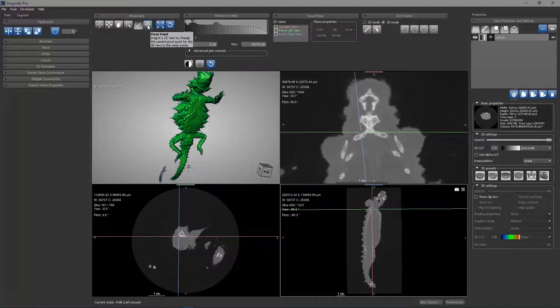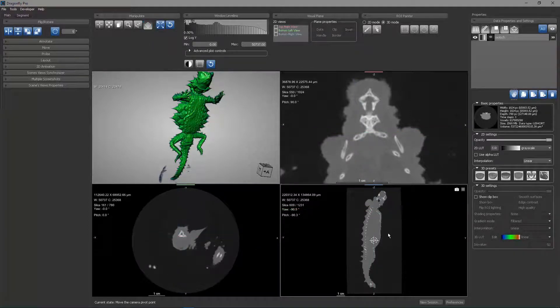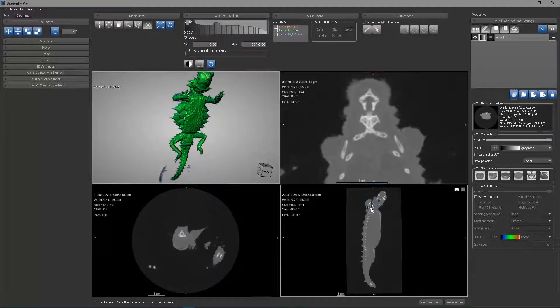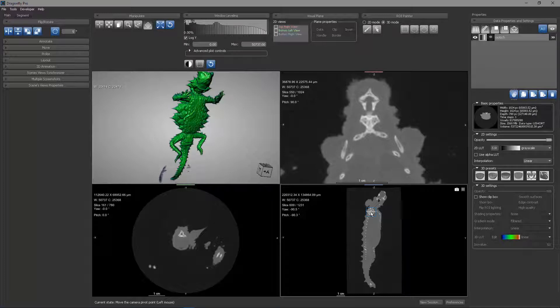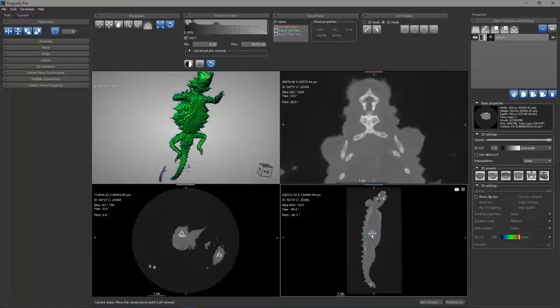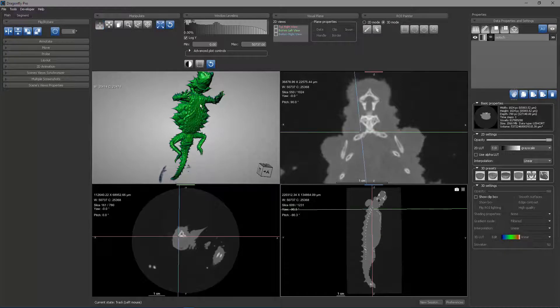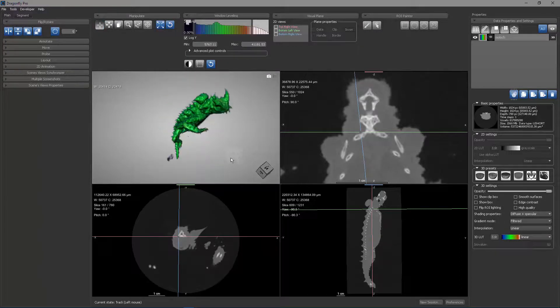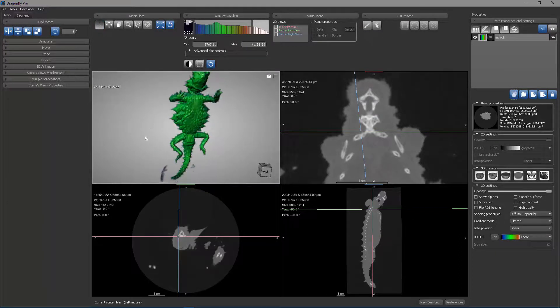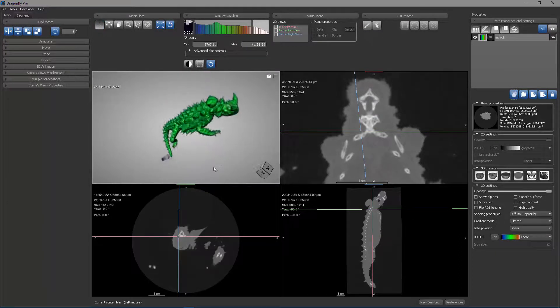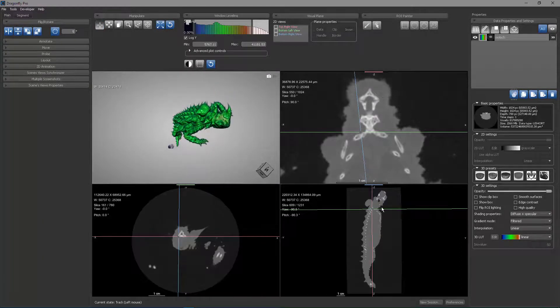The next state button on the manipulate is the pivot point. The pivot point allows you to reposition where the 3D track will pivot. This changes your center of rotation. If I have it here, and I'm in the track state, I rotate in track and I move around the middle of this moloch.